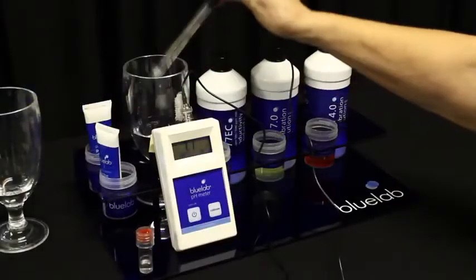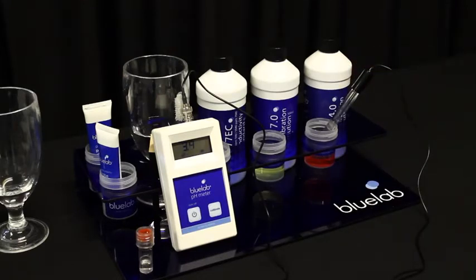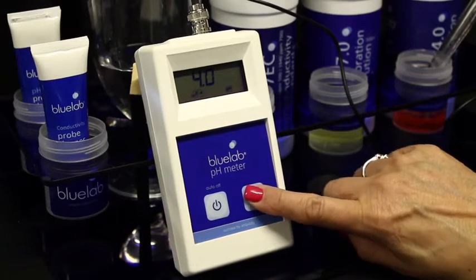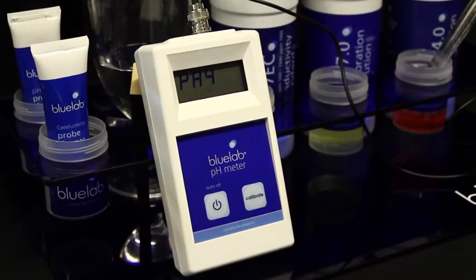Rinse the probe tip in clean tap water and place it in pH 4.0 solution. Be patient and wait for the reading to stop — it may take a few minutes. Press and hold the calibrate button until CAL appears on the screen, then release the button. You have successfully calibrated when you see both calibration indicators on the screen.